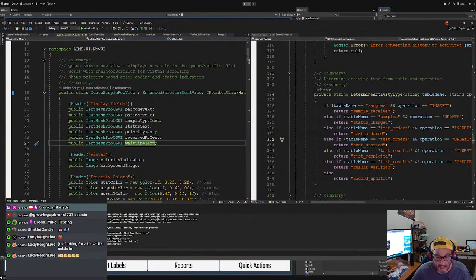Then we got received. Hope I spelled that right. Received, yeah. No, I didn't. And then wait time.